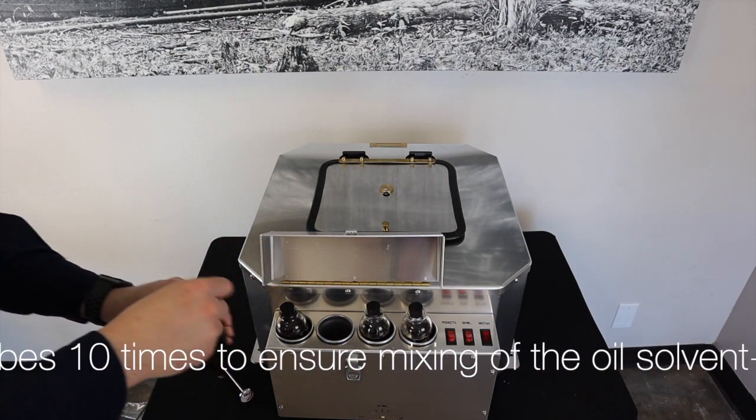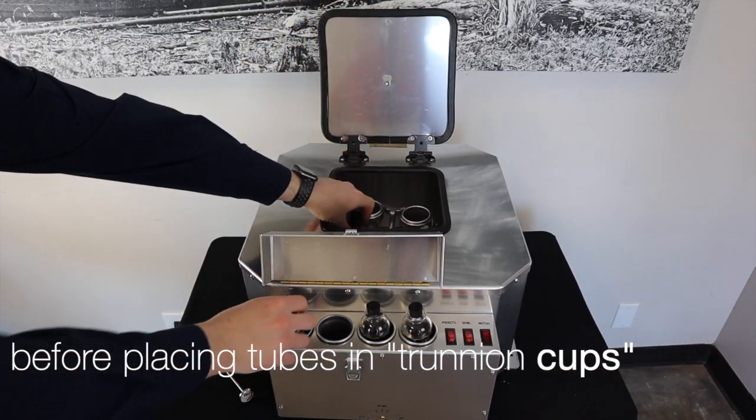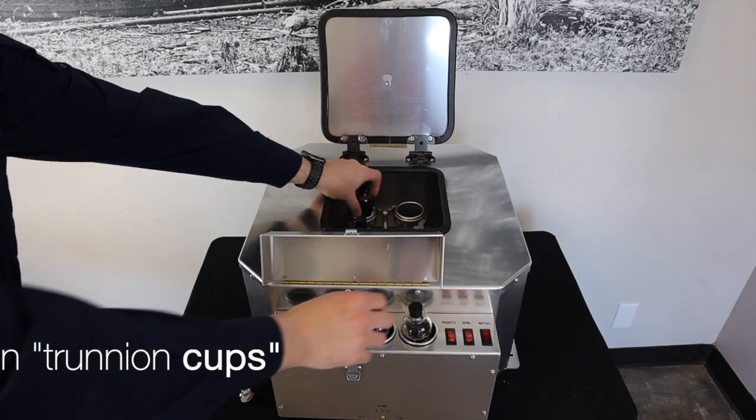Once the temperature is in compliance with API standards, remove the sample tubes from the preheater pockets and place the tubes inside of the centrifuge shields.